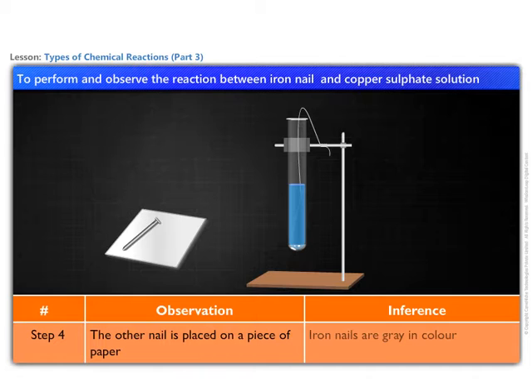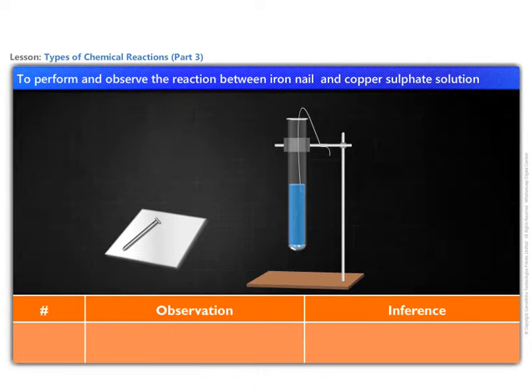Retain the other cleaned iron nail on a piece of paper. This will be used for comparison. After about 20 minutes, remove the iron nail from the solution and keep it on a sheet of paper.